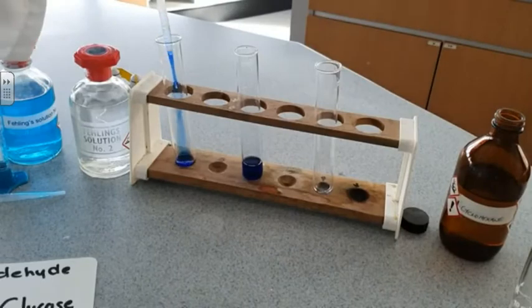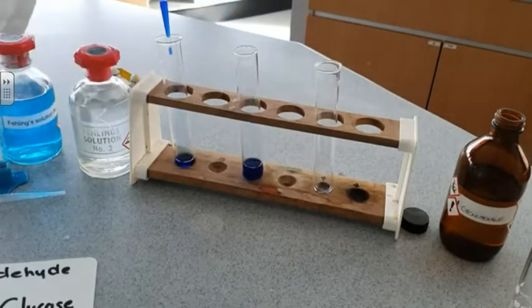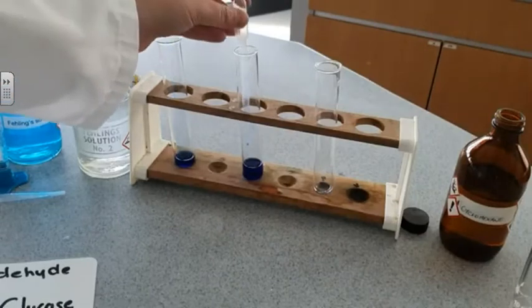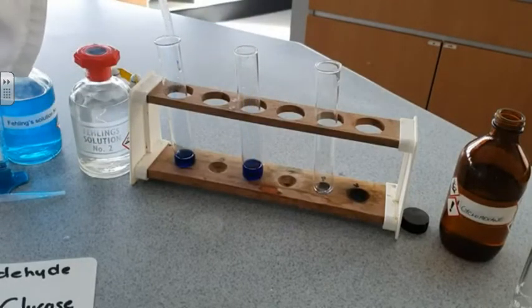Small amount of that. We're going to use this on 2 separate tests, one with an aldehyde functional group in, one without, so that you can see the difference. So just going to separate that so it's equal quantities.